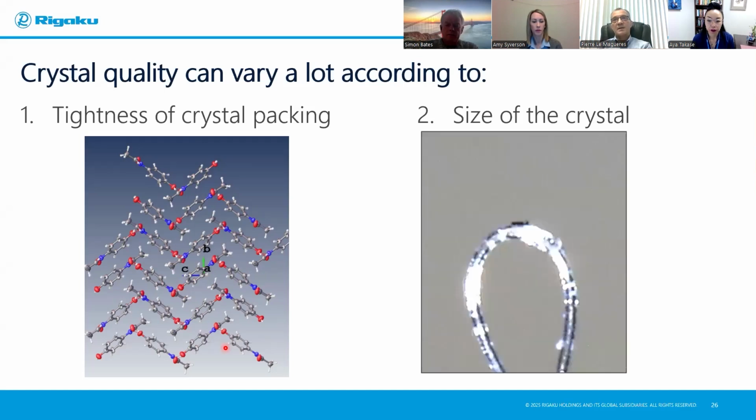And here I have a picture of a small crystal. You see that little dark rod here is really small. The length of that crystal is okay, actually 45 microns, but the cross section is only 13 microns by 13 microns. And sometimes that's all you've got. You can't crystallize crystals in larger dimensions, and sometimes you're even stuck with no crystals at all. All you have is a powder, a crystalline precipitate.